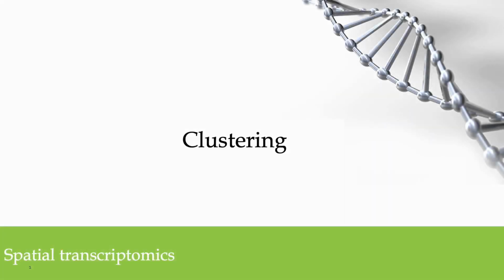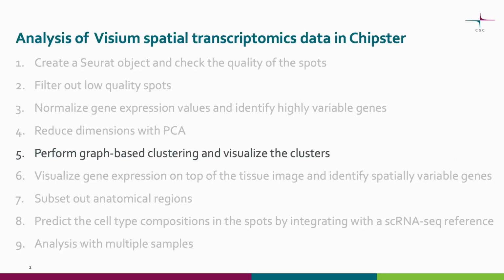In this video, we will cover the clustering step when analyzing Visium spatial transcriptomics data in Chipster. In this step, we compute clustering in the selected PCA space and use the nonlinear dimensionality reduction method called UMAP to visualize the computed clusters.